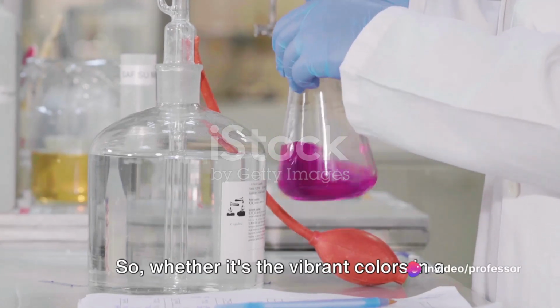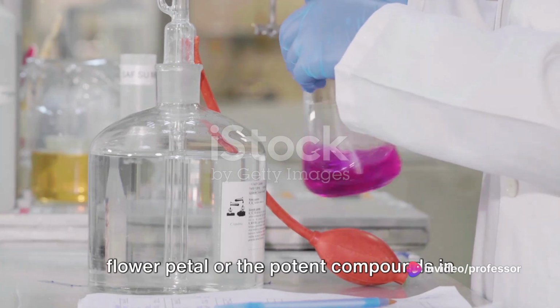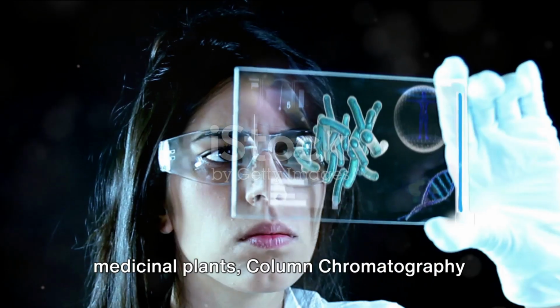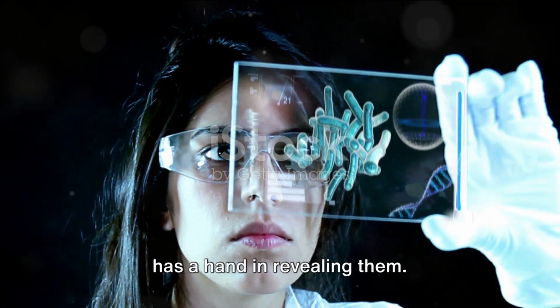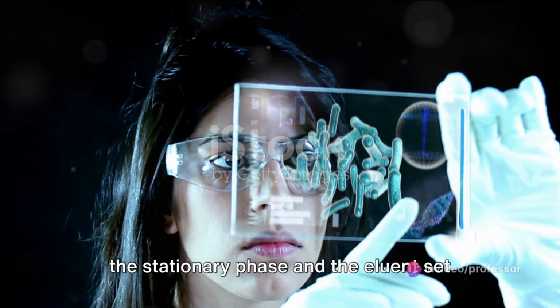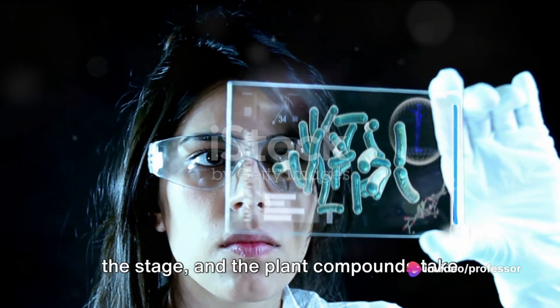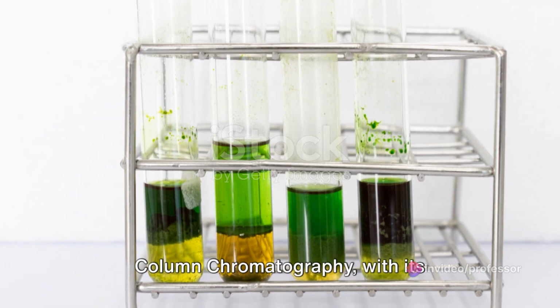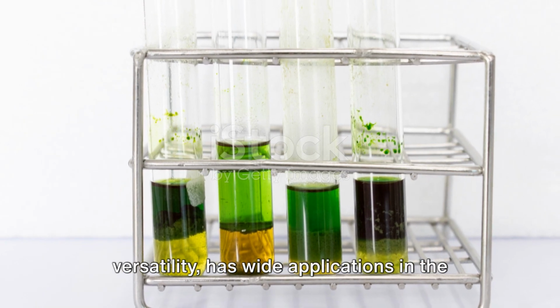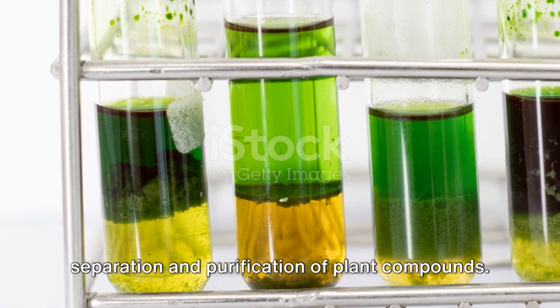So, whether it's the vibrant colors in a flower petal or the potent compounds in medicinal plants, column chromatography has a hand in revealing them. It's an elegant dance of chemistry, where the stationary phase and the eluent set the stage, and the plant compounds take the spotlight. Column chromatography, with its versatility, has wide applications in the separation and purification of plant compounds.